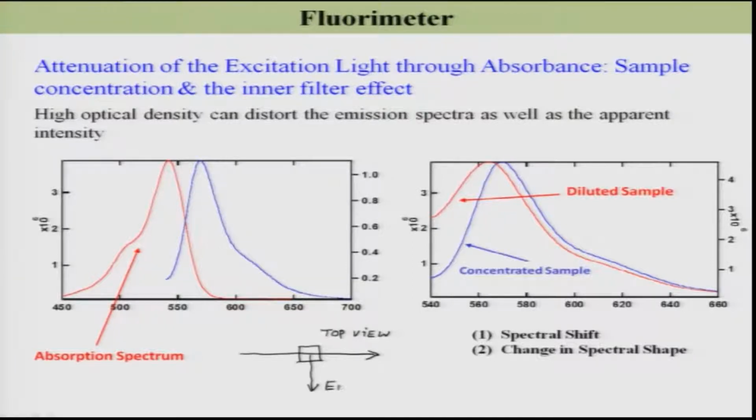This is my emission and this is my excitation. I am going to collect this emission from the middle side, and please note that we usually use a slit over here and a slit over here to collect this emission. This is necessary for the dispersion in the monochromator. So, using this slit, I am going to collect emission only from this region.